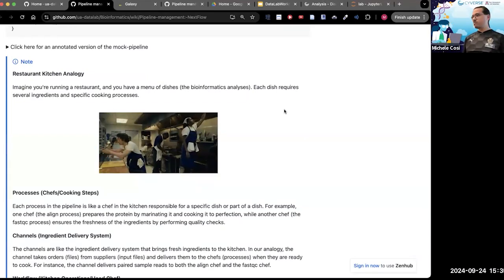I can't get you one right now, Randall, but flowcharts are available in nf-core, and since this does come from an nf-core sister, maybe I will be able to get you one. Maybe I can mention this in the next iteration. Maria did share training.nextflow.io. Thank you, Maria. That is a link that I will be sharing later on as well. It's a great place to really understand Nextflow itself.